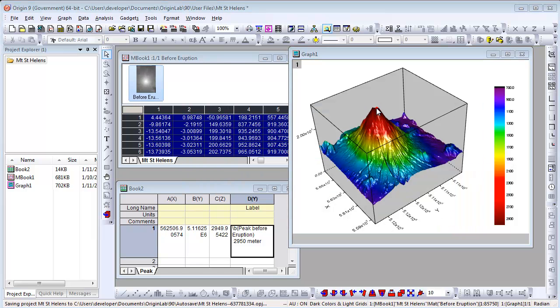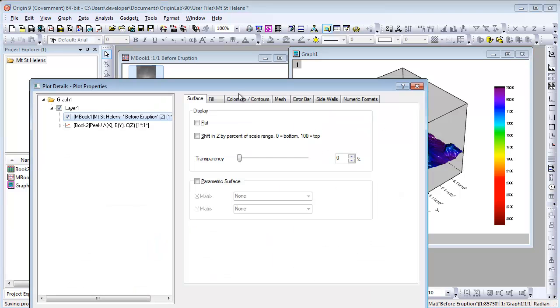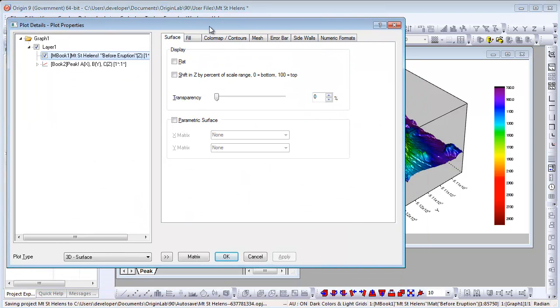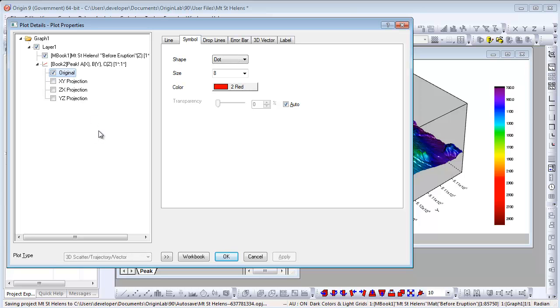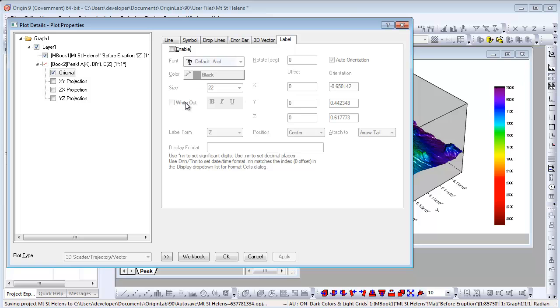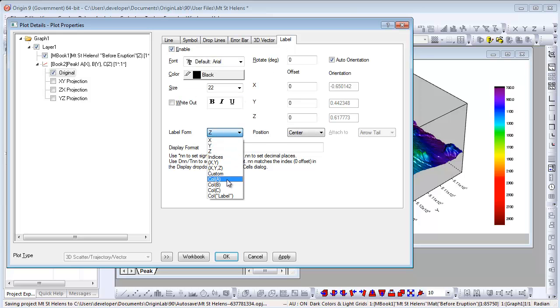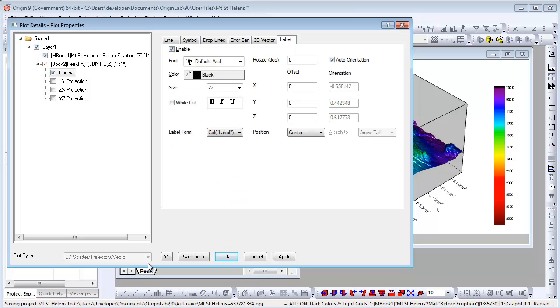Let's double click the point to open the plot details dialog. On the left panel, make sure the 3D scatter plot's original node is selected. Go to the label tab to enable label and specify where the label is from.